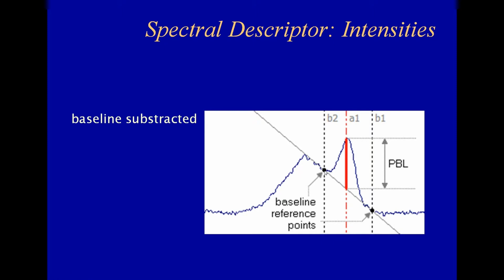So what we implemented is that we just define a region of neighborhood, and within that region, which normally is 5, 6 or maybe 10 points, the signal values are averaged, and the average y value is used as the baseline reference point. And the same is done here. So by averaging those signal levels, you get a more stable reference point and of course a more stable baseline.